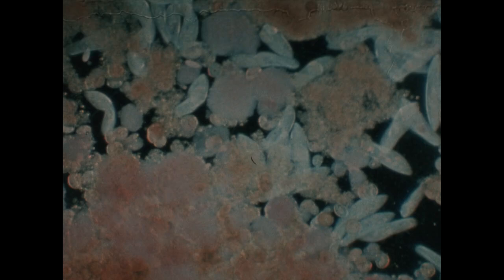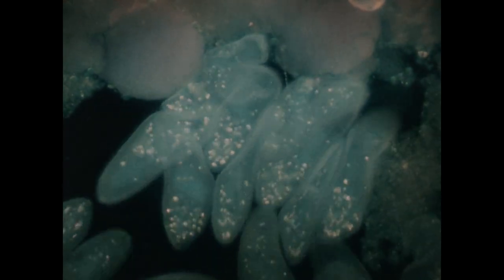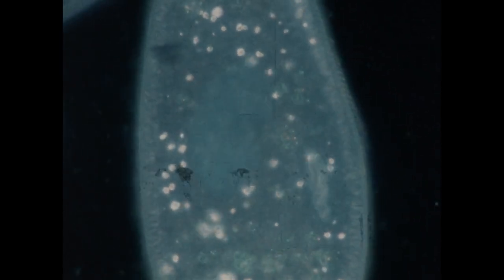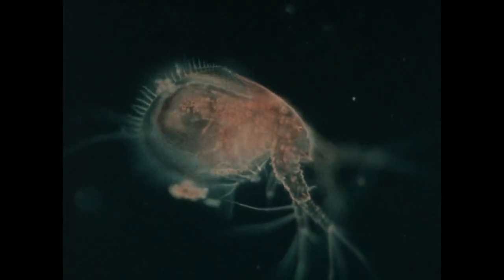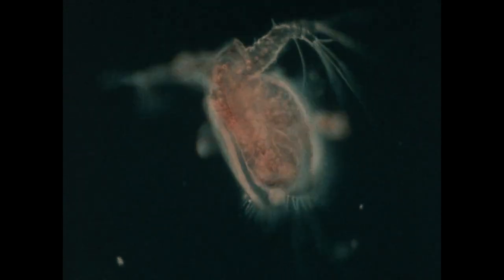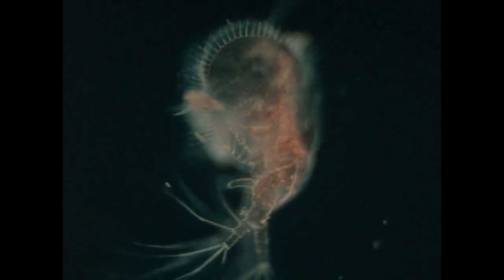Changing from bright field to dark field shows new features, like the color of these clumps of bacteria and paramecium's bluish nucleus. Many subjects are more interesting to look at in dark field. It is as though you had shrunk to their size, examining them in their own hidden world.